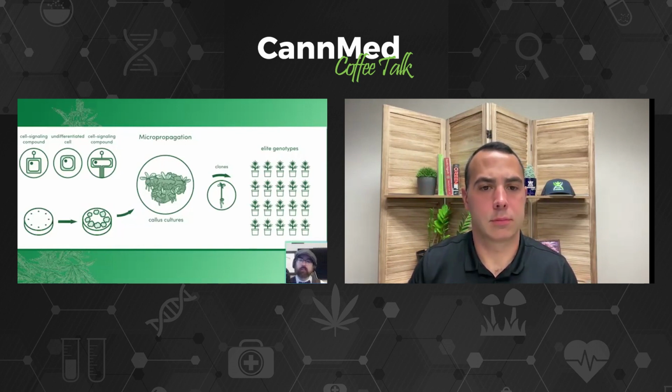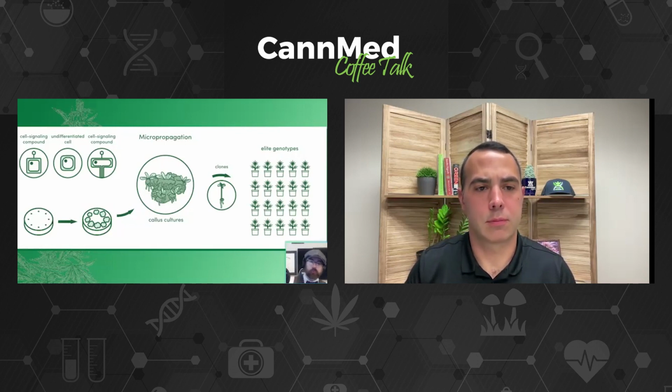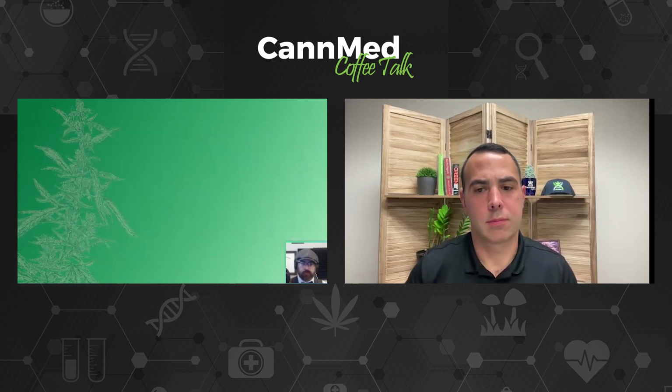And in this micropropagation slide, what this is doing is we're taking some of the body tissue, converting it into callus, and then converting that tissue in that callus. While we're making the callus grow over and over again, we're also telling it to make more plant babies. Now, that's the cartoon version. These are some of the research pictures. They might not necessarily be as clear.